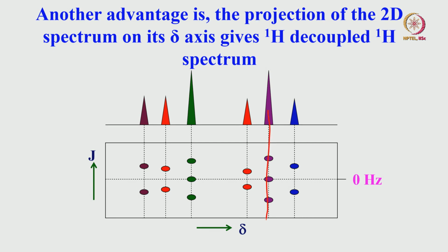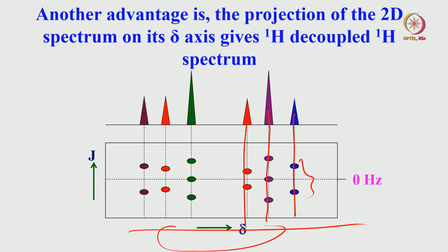See, look at it, this gives you chemical shift, this gives chemical shift of this proton, and this gives you J coupling. What did you do here? No HH coupling. JHH is completely removed, because you are removing all proton-proton couplings here, it is broadband decoupled. So, directly you can get the chemical shifts. This is the beauty of this experiment. 2D J-Resolved, if you take it and take the projection of it onto F2 axis, you are going to get chemical shift of all the protons.